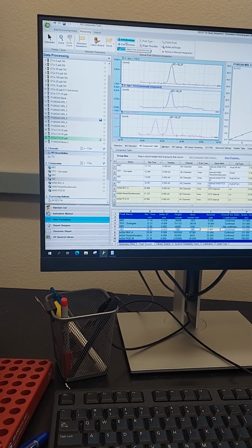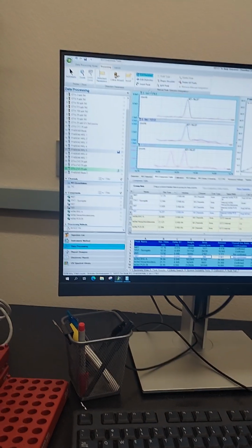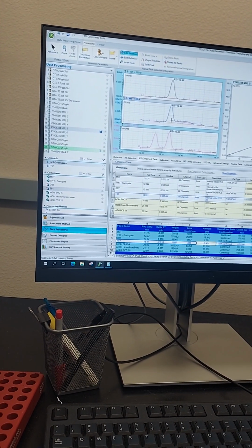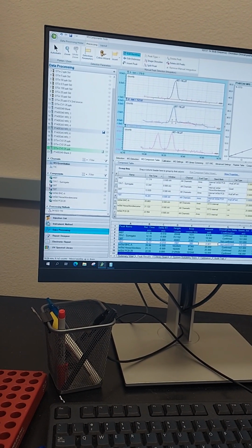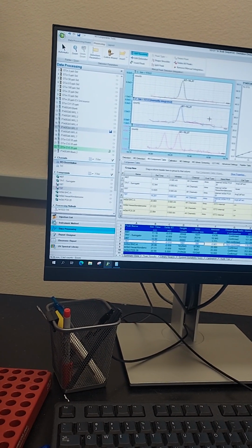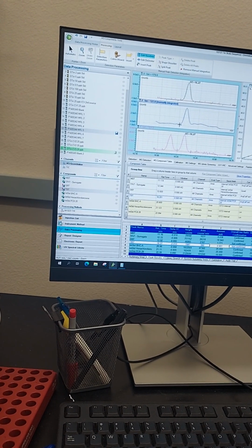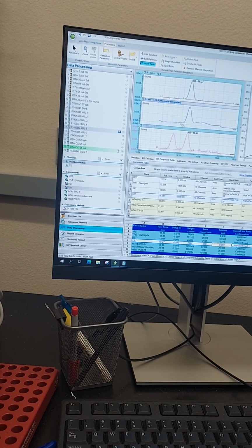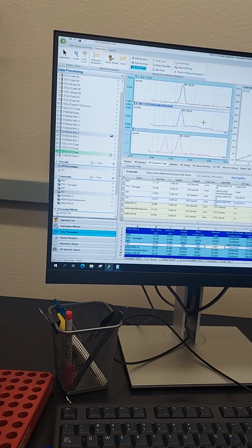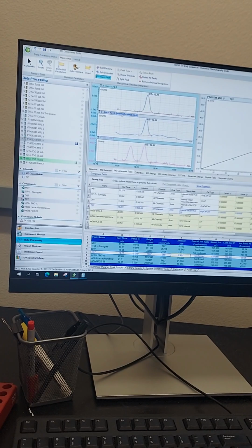But yeah, there are other types like edit baseline, if you didn't delete the baseline. So whatever's selected here is what it starts with, and then that lets you do this to the baseline. But I like to just delete everything there and start, just insert a proper peak. And does it appear in the others here and here? Nope, only this one says manually.